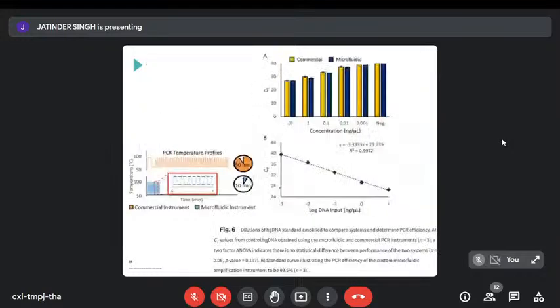And that's shown here. If we look at a normal PCR machine, we've got close to an hour of heating up, cooling down, heating up, cooling down. If we go to this chip-based system, we can decrease that by a factor of five to only have 10 minutes of very quick up, down, up, down, up, down. And as you can see here in the microfluidic system, we get very similar amplification outcomes. We get similar Ct or Cq values compared to a commercial PCR system. But we've reduced our amplification time, the time that it takes for our PCR reaction to take place, from 50 to 10 minutes. Very nicely, for those of you that do PCR, we've got a slope of -3 here and a good R squared value, meaning that our amplification operates the way it should be working.